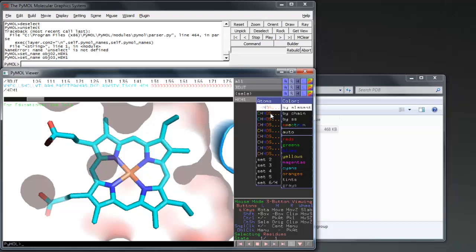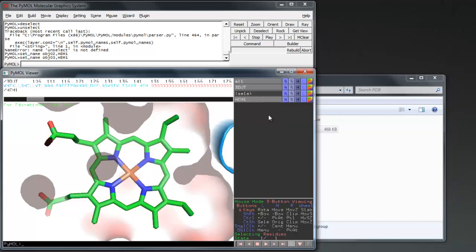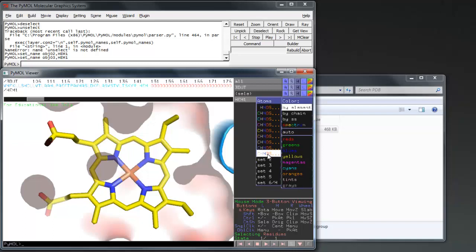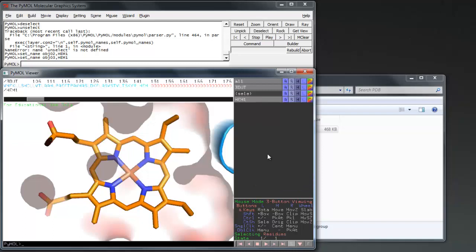I color by element to emphasize the iron component in the center of my heme. Make sure that your object will stand out against the rest of your protein.